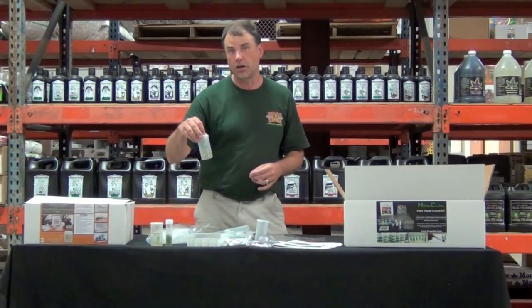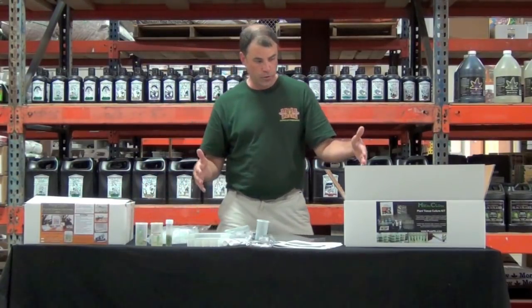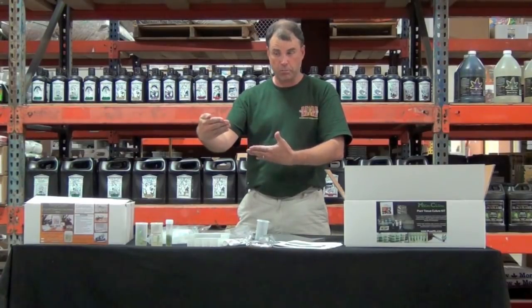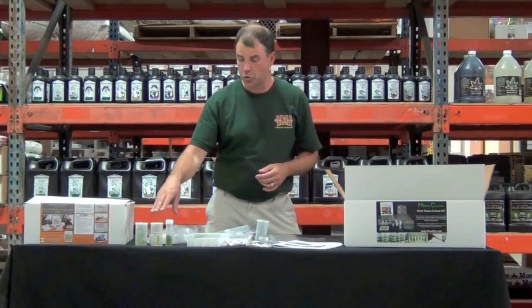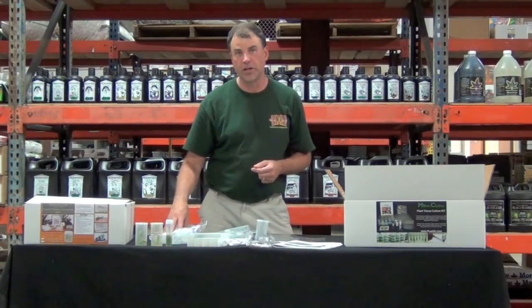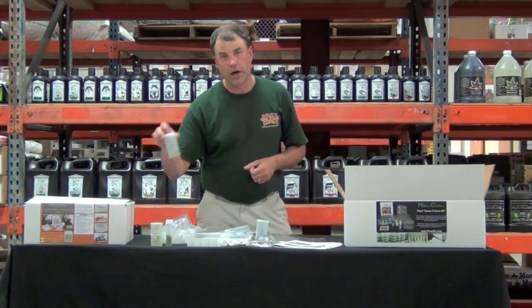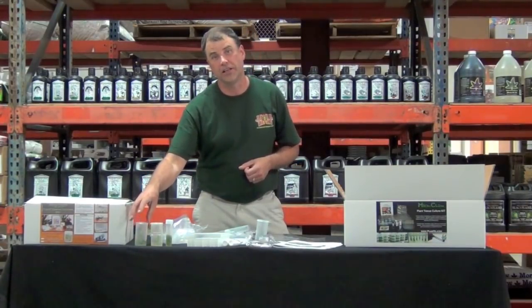You can contact Monster Garden for more of the plastic flip top vessels. Later, when you're up and running through the leapfrog fashion of plants and bottles — bottles waiting for plants and using them over and over — you can choose whether you prefer the glass jars or the plastic vessels. The lids have been more popular for kits sold overseas because the jars are available locally and the lids are much lighter and smaller for shipping, whereas the plastic bottles can cost a lot to ship — especially for you in New Zealand and Australia.